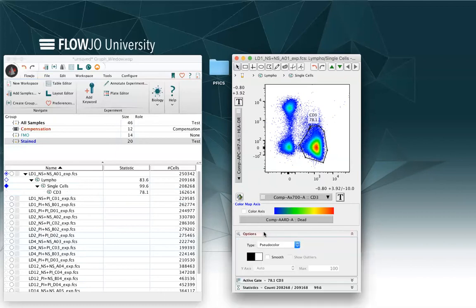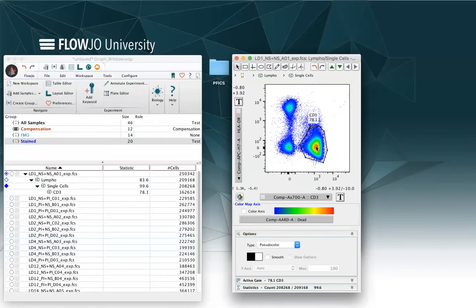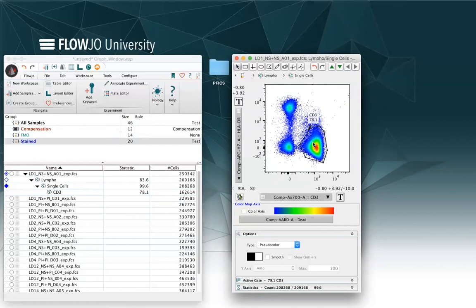So I can have a pseudo color, which is shown right here, that identifies the more dense areas with red and orange, middle density area with yellow, and low density area with green and blue.